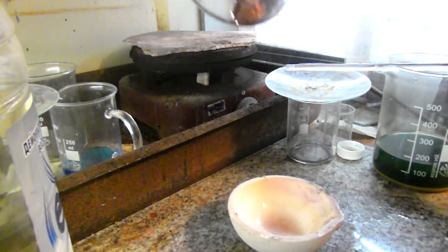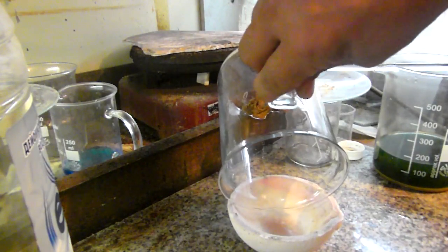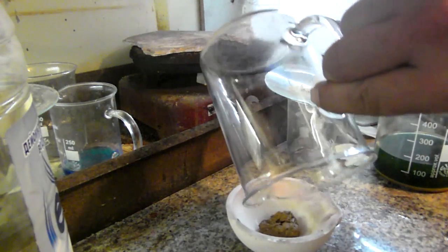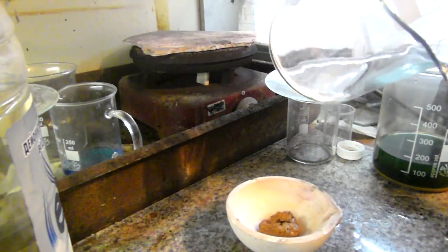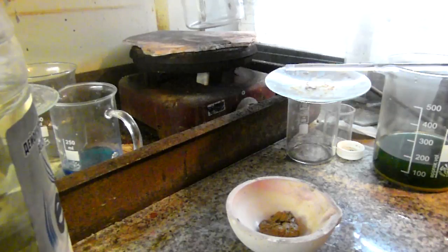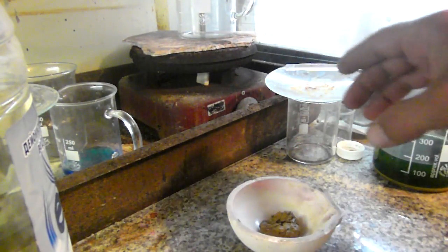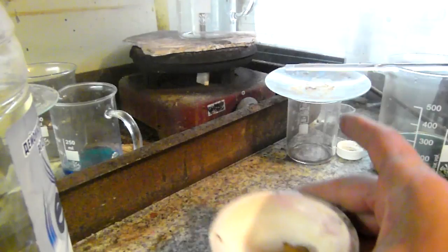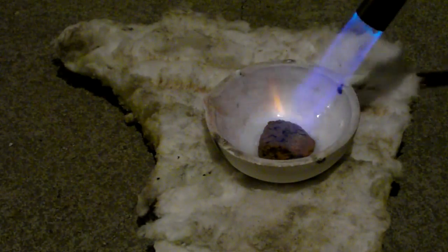Then I moved the gold while still moist to the melting dish. Drying the gold sponge with a soft flame.